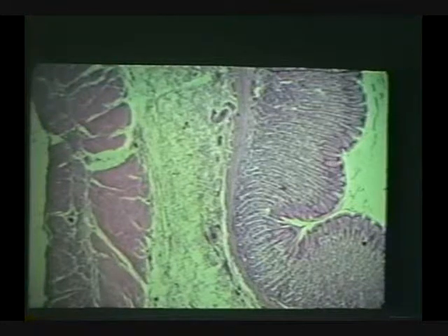There's your gastric pit. Identify the membrane from here to here. Mucous membrane. Identify the layer. Muscularis mucosa. Identify the tunic. Submucosa. Tunica submucosa. The tunic. Tunica muscularis. Do I see 1, 2, 3 layers? Yeah, the stomach often has 3 layers, doesn't it? There's a diagonal layer thrown in.